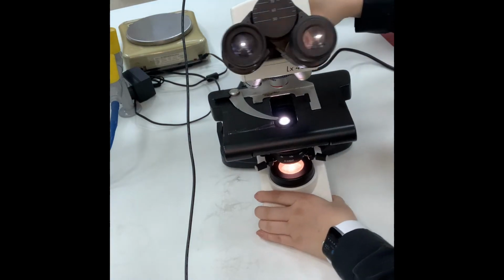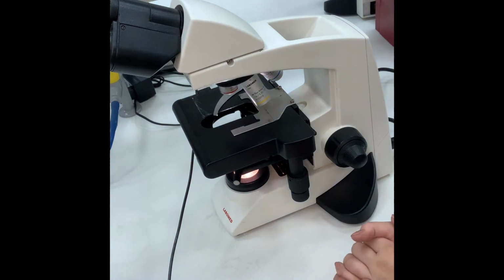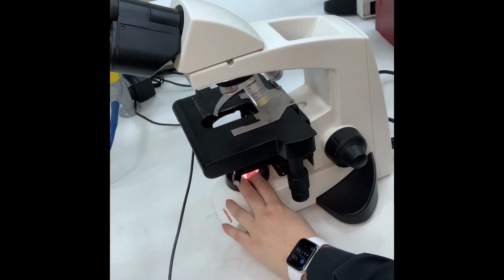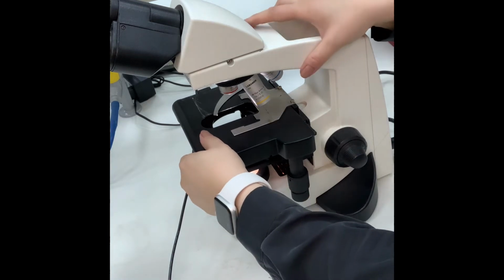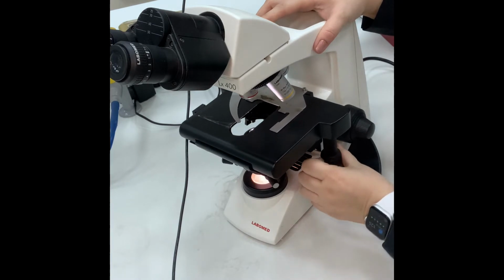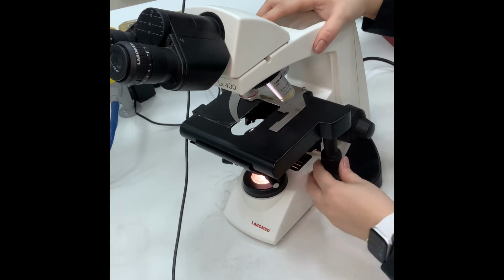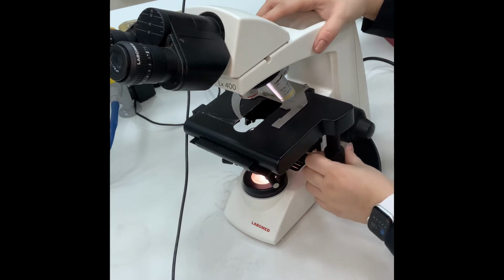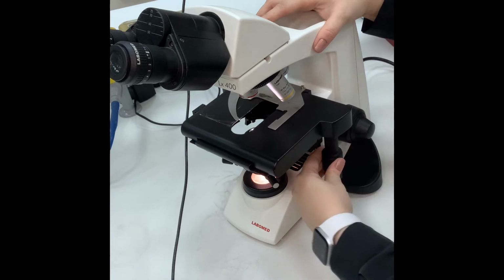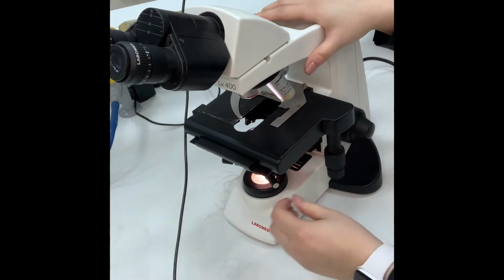So before we know how to use the microscope, I need you to understand the basic building parts of a microscope. This is the base, this is the light source, this is the stage, and I control the movement of the stage by mechanical knobs. In your assignments that I will give you, in the picture, you have A and B. This is just right and left, so both of them you can call mechanical knobs.